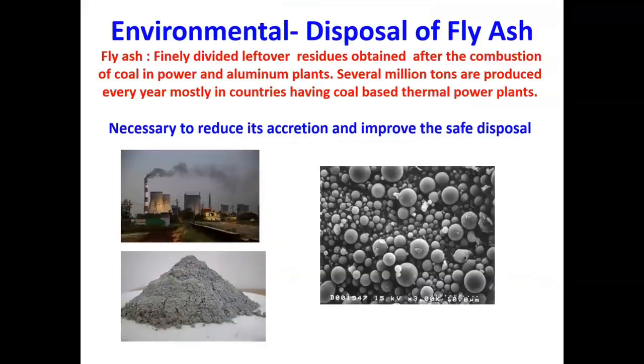So now I will give some examples of those applications which are possible with TXRF, but either not possible with other conventional techniques or possible only with great difficulty. So the first application is when we don't want to dissolve the sample or dissolution of the sample is difficult.